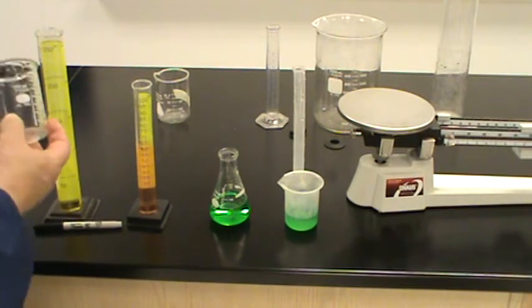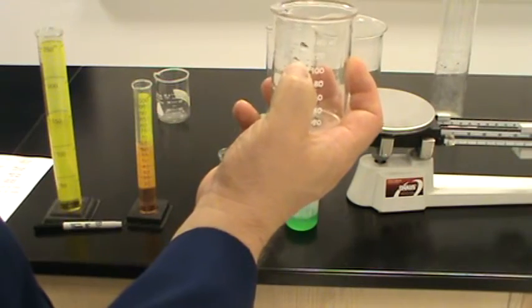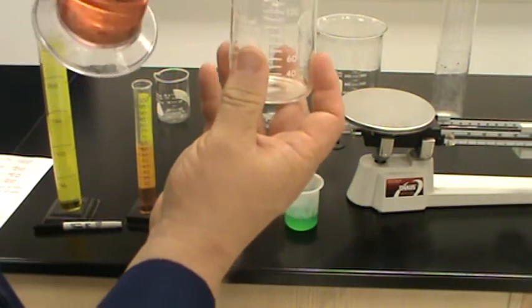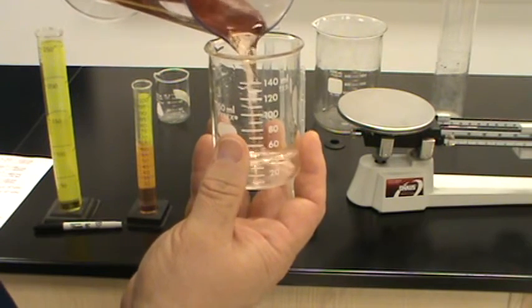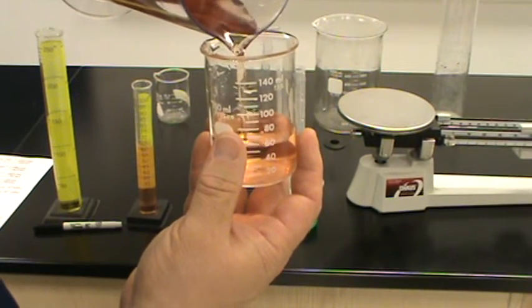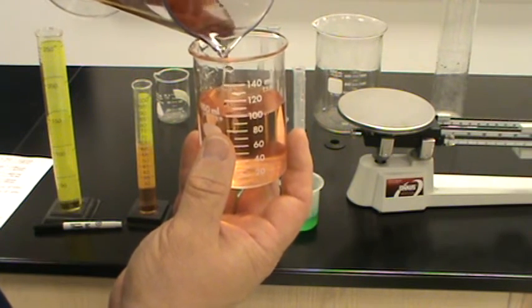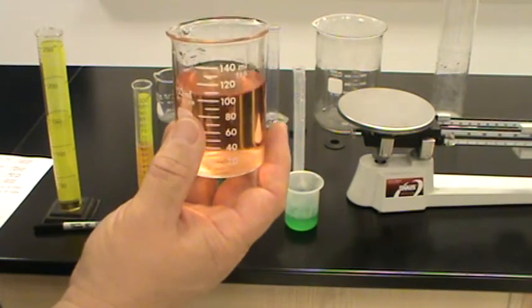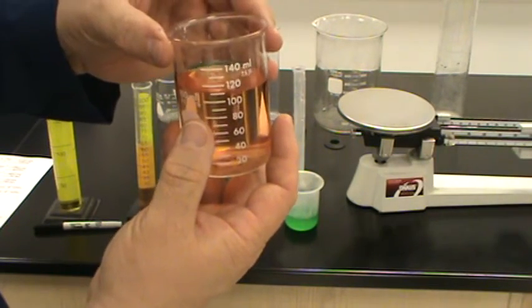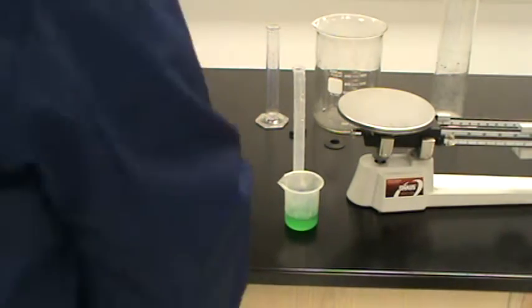And then finally, I asked you to put in 110 milliliters. That'll come to this line right here between 100 and 120. So here I go. I'm filling very gently, very nice and slow. I'm at 100. I come up and I come right to the 110 milliliter mark. So 110 milliliters of liquid.